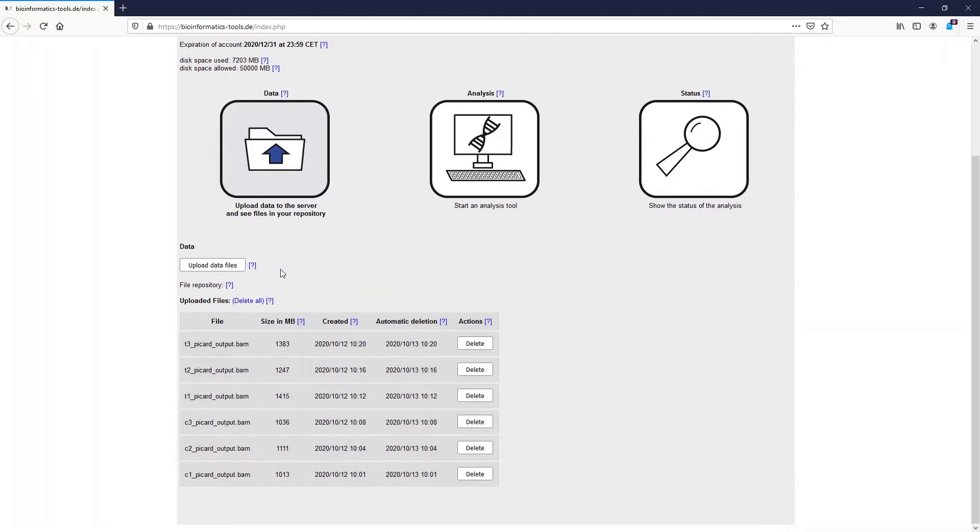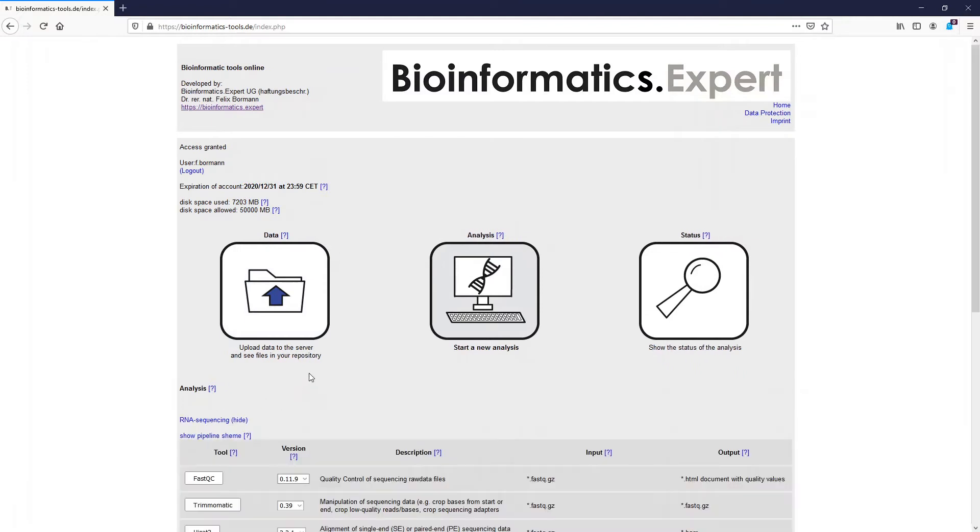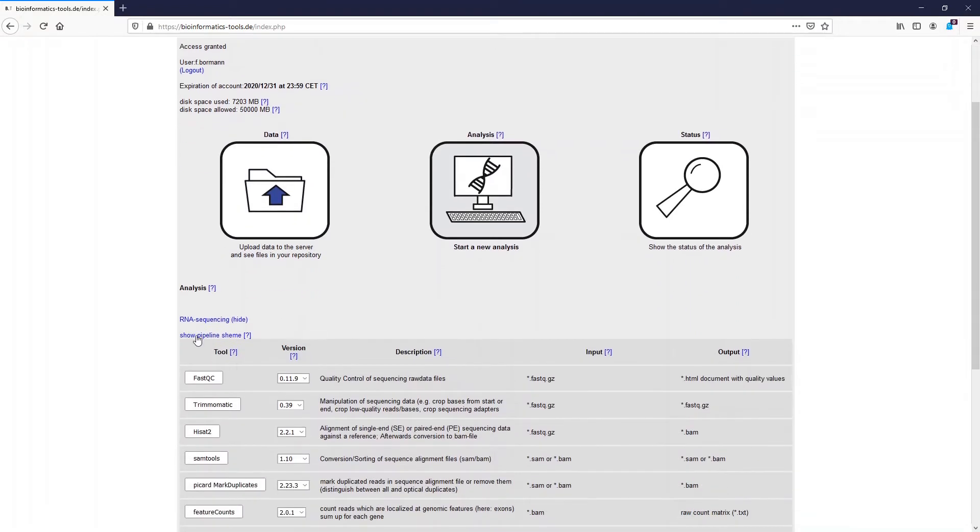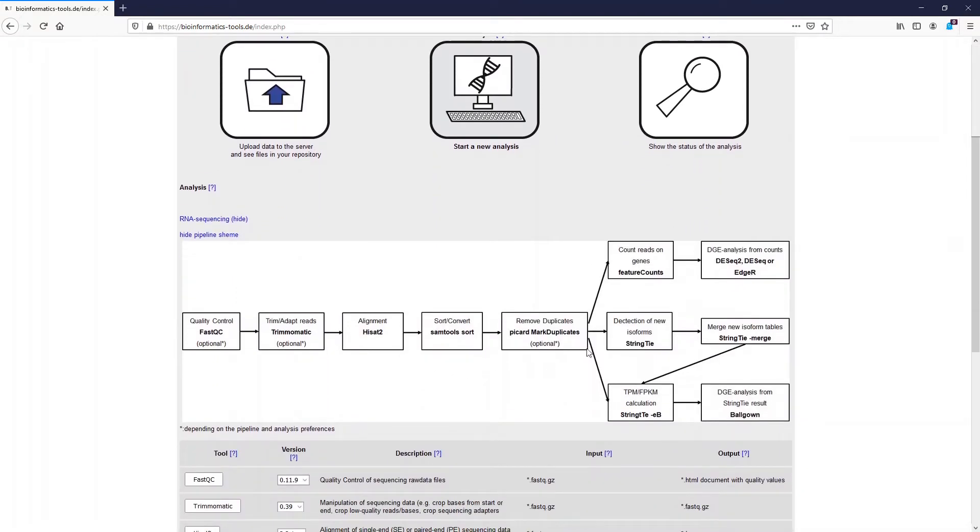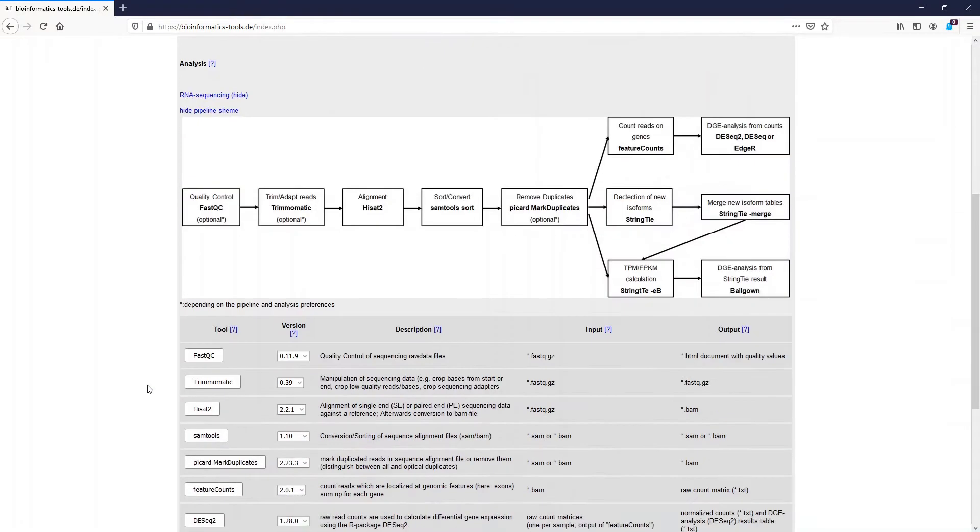Please watch the video about differential gene expression to recapitulate these steps. With the BAM files we now use StringTie to detect new isoforms. Afterwards we merge the output isoform tables with StringTie merge. Then we run StringTie again and calculate the TPM and FPKM values. We also create output which can be used with Ballgown to run a differential gene expression analysis. Actually this is then the fourth possibility to detect differentially expressed genes with Bioinformatics Tools Online.